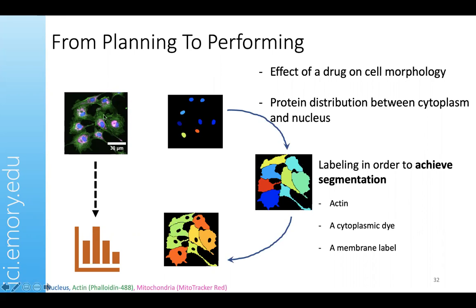So what would you do? I showed to you image thresholding and segmentation, right? So we will take advantage of image thresholding and segmentation that you are seeing in this pipeline. You can do some image math and say, subtract the nuclei area from my cellular area, which will now give you the area of your cytoplasm, okay?